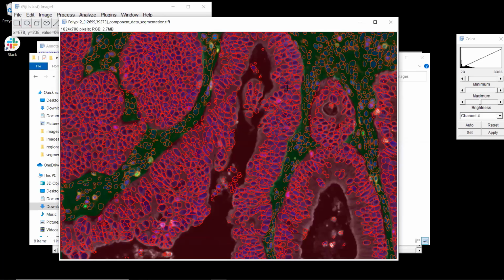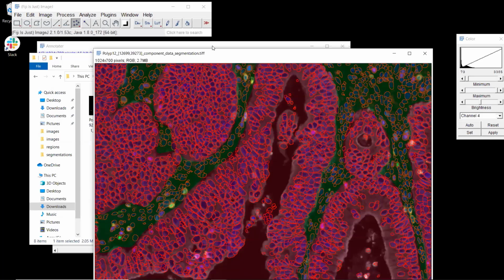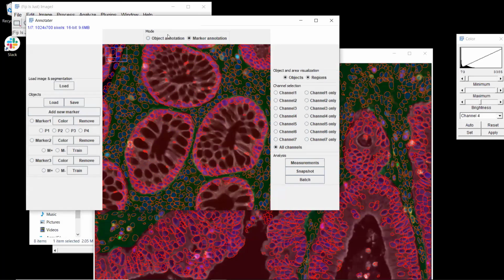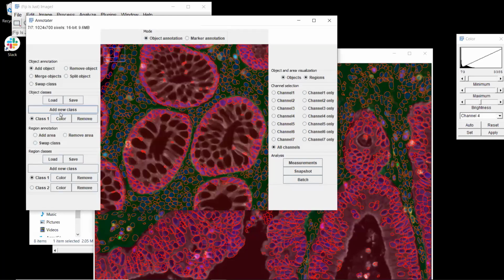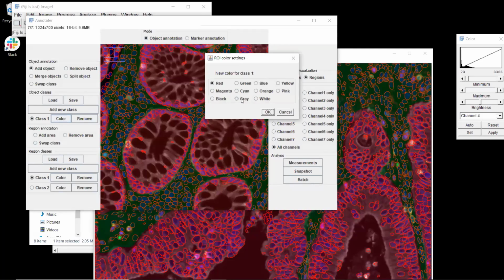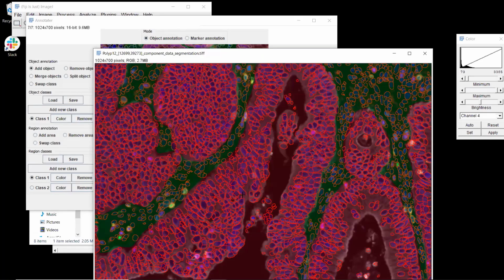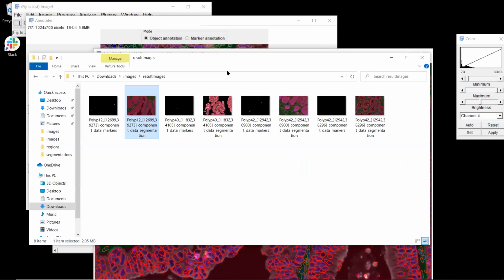If you don't want to have these colors, before doing your batch processing, you need to define the right colors. So here, for example, if you were to have defined gray for your nuclei, I would have this instead of this. So the colors here depend on how they were defined here. But that's very important because here, as you can see, you can look at your results.